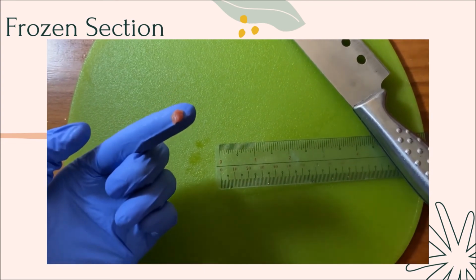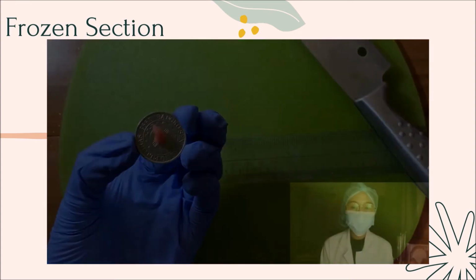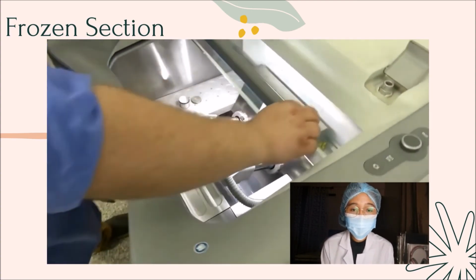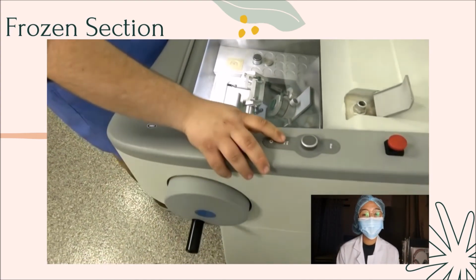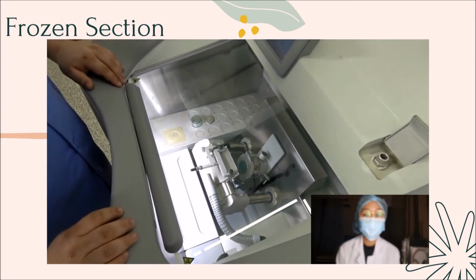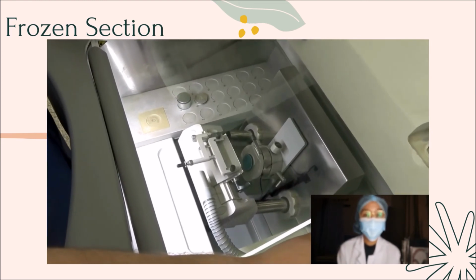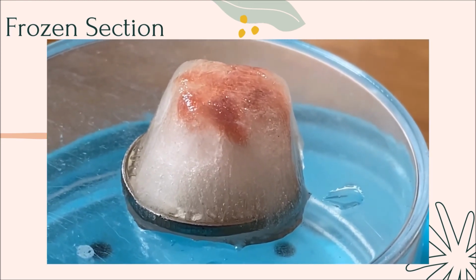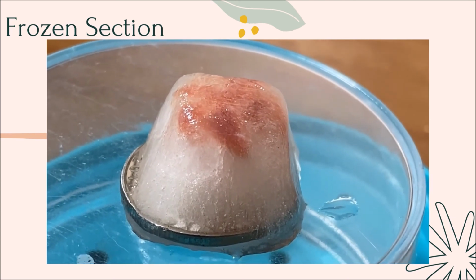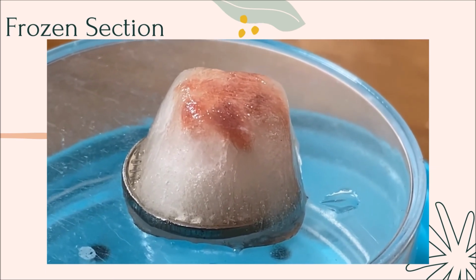Now that we have a specimen, we should prepare a freezing medium and put it on top and proceed to the cryostat. So we will be utilizing a cryostat. A cryostat is a chamber kept at about -20 degrees Celsius. The specimen that we have seen before is placed on a metal disc, and it is frozen at about -20 to -30 degrees Celsius and will be left for 2 minutes. The specimen is now embedded in a gel-like medium consisting of polyethylene glycol and polyvinyl alcohol. This compound is known by many names, and when frozen, it has the same density as that of the frozen tissue.